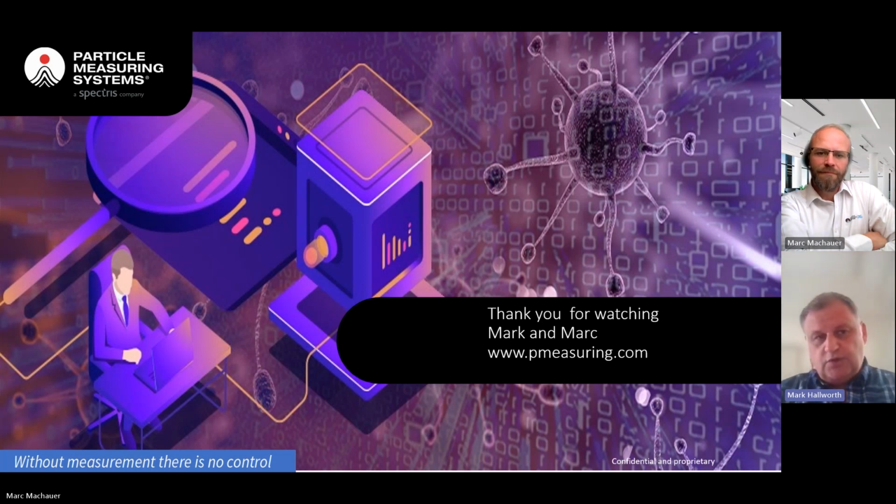And there's 2 primary ways of cooling the gases down. One of them is to use a cooled probe, much like a distillation probe, where we have cold water running around the outside of their inner tube to bring it down. And the other one is by dilution. So you can dilute the sample with a lot of air to bring it down to a manageable temperature. Both of them, if you have a wet tunnel, obviously cooling it's just going to fill your particle counter full of liquid, which we love, as you know.